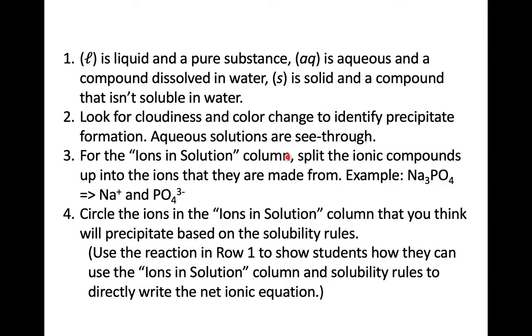Aqueous solutions are see-through. And a really good way to do this, when you guys are in the lab, if you can't tell, is to go to a window and look at transmitted light through the solution. If you look to the outside light through the window, it's often easy to see if you have, in fact, a suspension that's going to settle down into a precipitate.